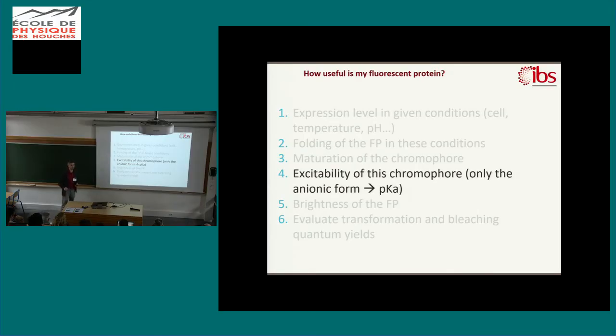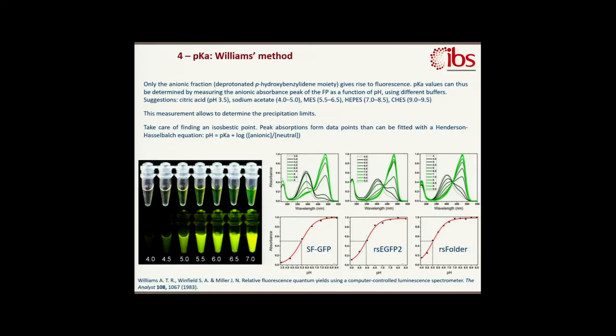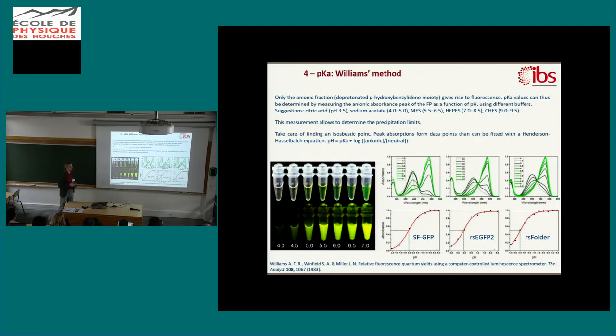Excitability of the chromophore. So it means the pKa, in fact, determining the pKa precisely, because the anionic fraction will be the one you can excite. So for the pKa, I'm using the Williams method. So the Williams method is that you take many absorption spectra on your protein. So you'll have again the equilibrium of neutral and anionic for your protein.